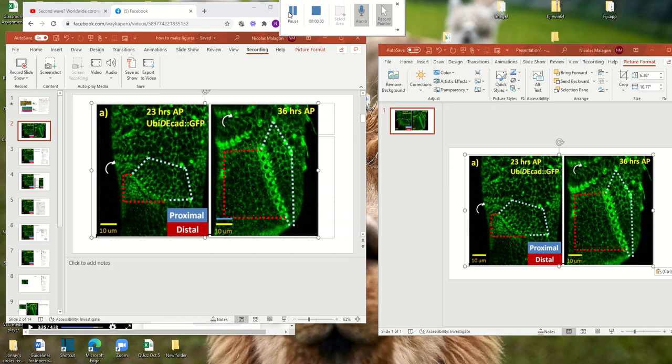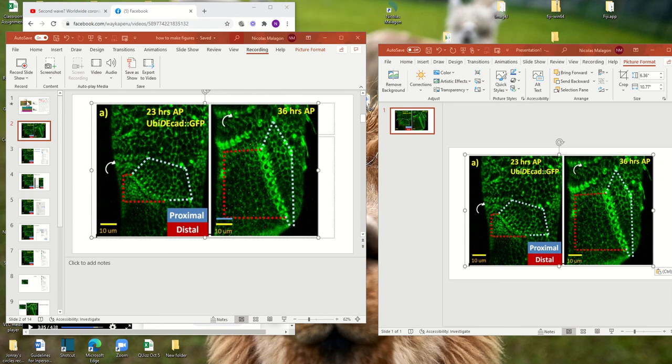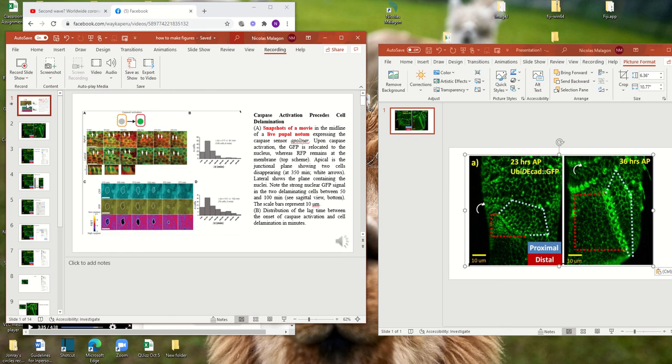Hello! Today we are going to talk about how to make a small figure with a scale bar, and I'm going to give you some tricks.